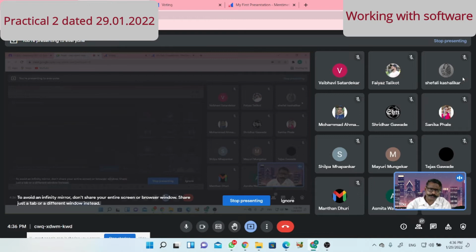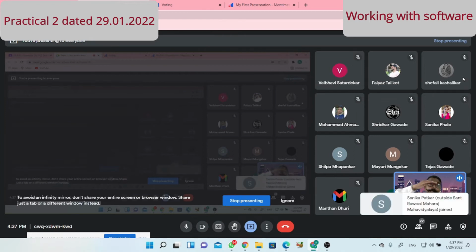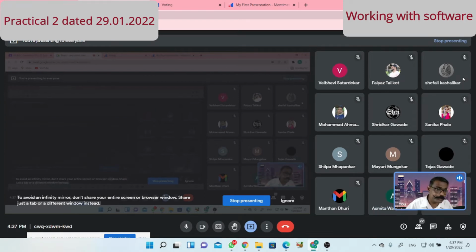So in such cases, what do we recommend? Unclamp the burette, remove the burette and bring it to eye level in front of the eyes, then adjust 0 and then clamp that. In such a case, 0 will do. But if it is 10 and it's coming to your eye level, then also no issue. If it is 15 and it's coming to eye level, then also there's no issue, provided that much quantity is available to get the end point.